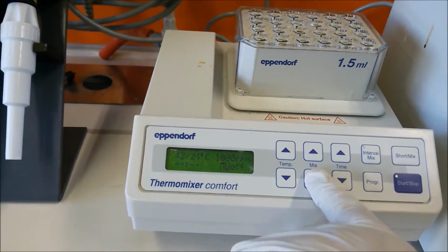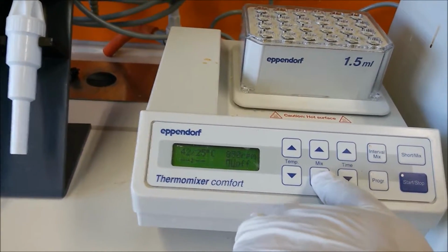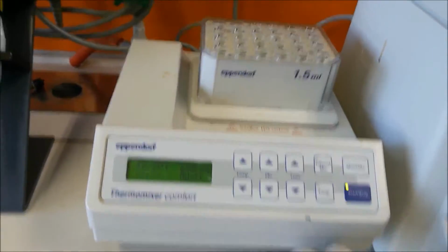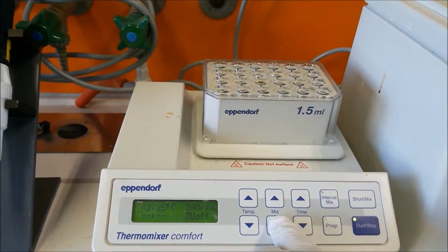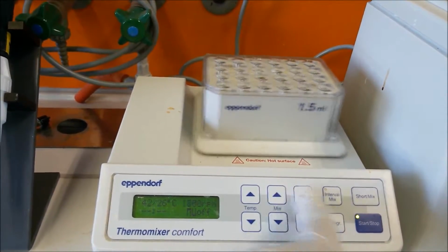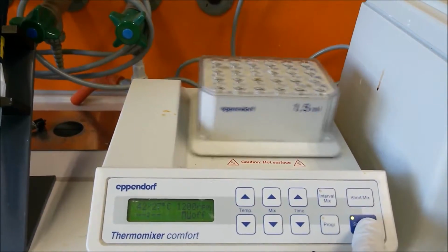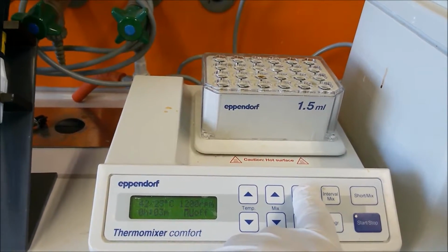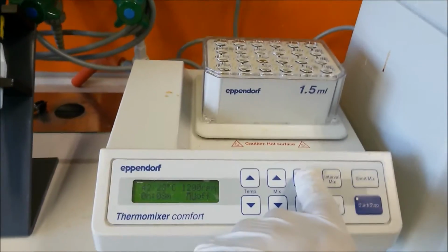Then there is a mix button, so here you can regulate how fast you want to mix, 1000 rpm, less or more. Okay, just have a look at it with the start button. So we can start it, you can see it now, it's moving. Okay, you can slow it down very slow, and you can make it faster, so you can see it is now moving very fast. We don't need it now. Yeah, and with the time button you can regulate. For example, you want to mix it for 3 minutes, 4 minutes, 5 minutes, 6, 7, whatever minutes, and hours.